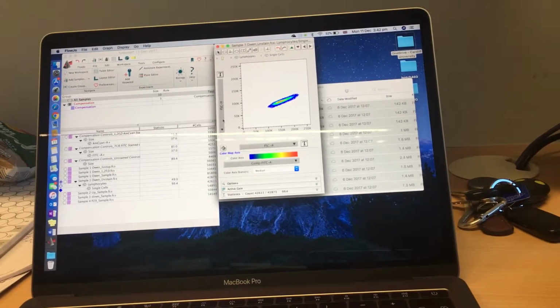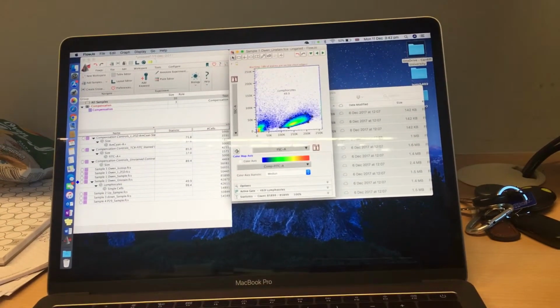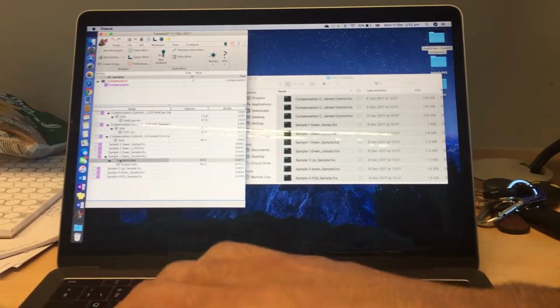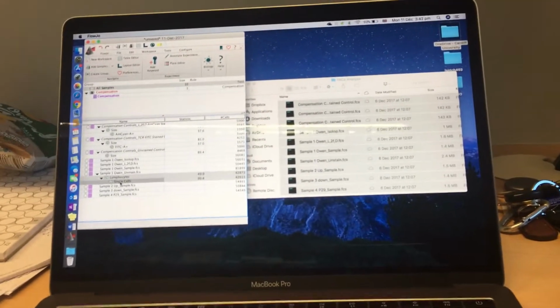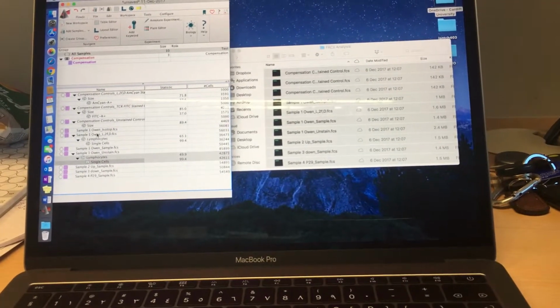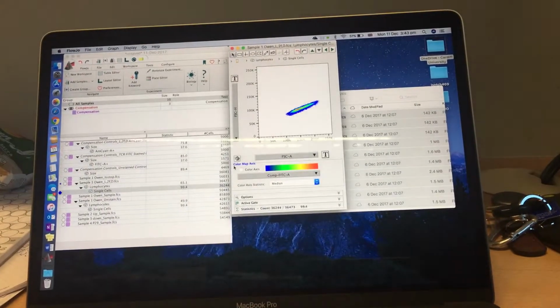Alright, so go into Live Dead. So drag. Okay, so highlight those two. Now the lymphocytes and single cells. And then drag it to the Live Dead. And then open the single cells on Live Dead. Single cells. And now do the cyan.